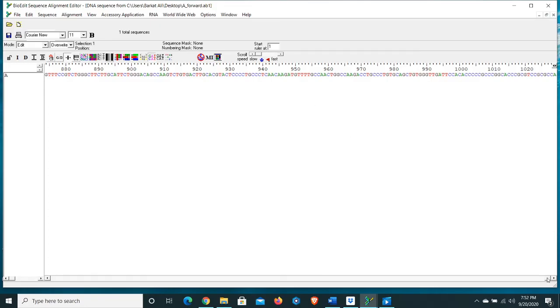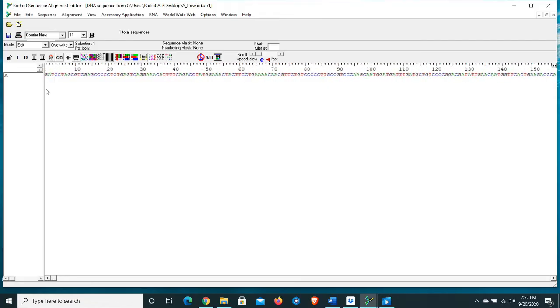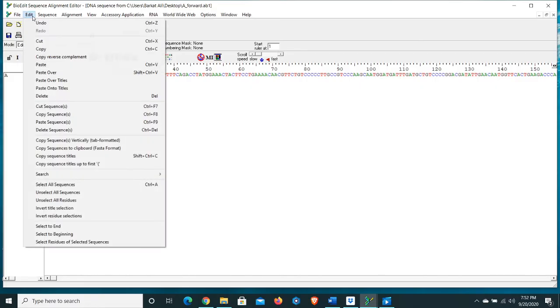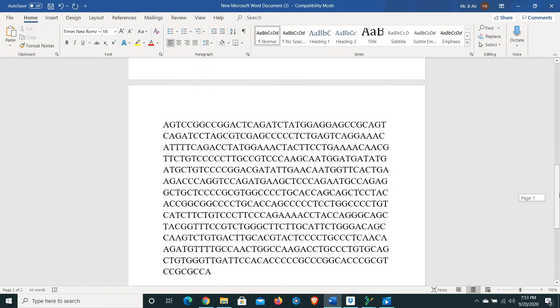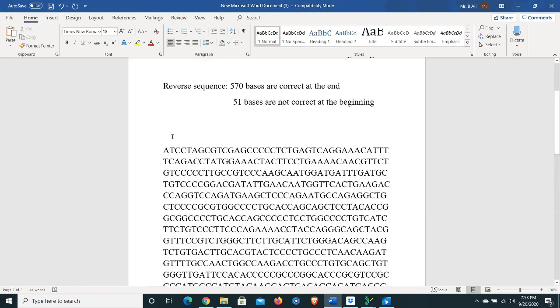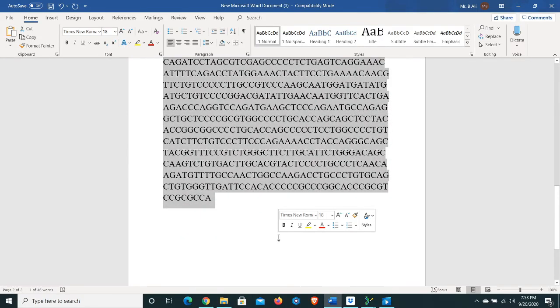We need to copy this whole combined sequence and paste it into a document for future record and BLAST analysis. Click here, go to Edit, select 'Select to End', and copy it. Name this sequence 'Aligned Sequence'. Copy it again and let's see the result of this sequence in BLAST analysis.